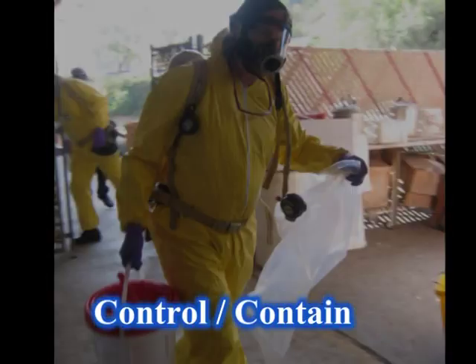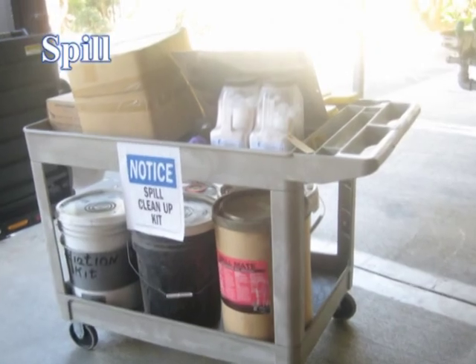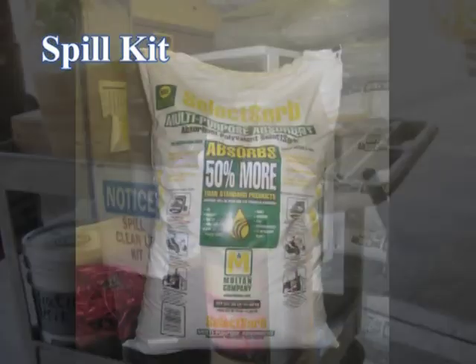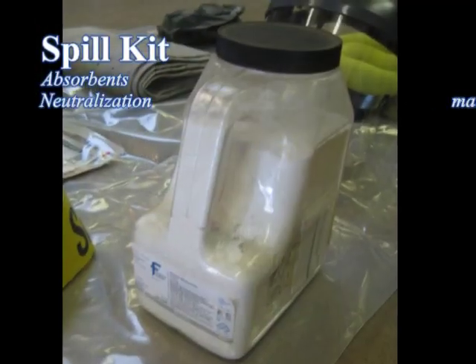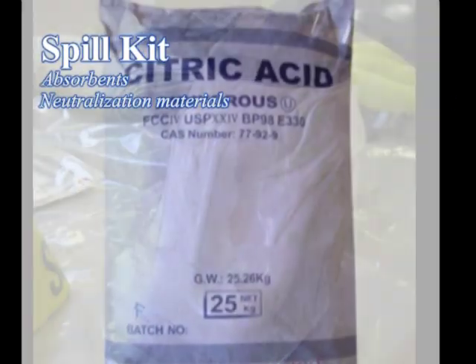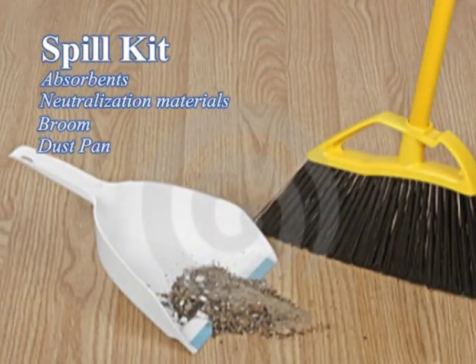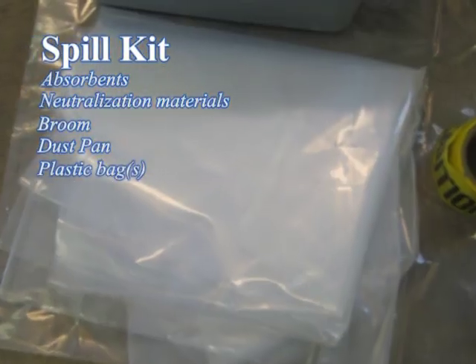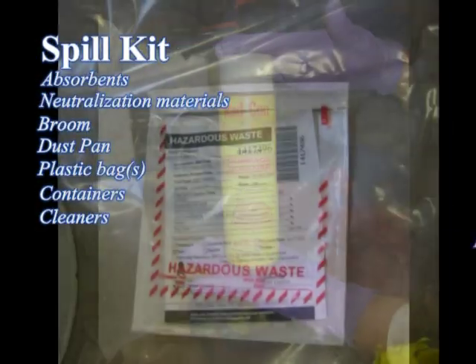After selecting the right PPE for the job, you can proceed to control and/or contain the spill. Start with obtaining a chemical spill kit. Examples of things you will need include absorbent material, chemicals to neutralize corrosives such as sodium bicarbonate for acids or citric acid for bases, a broom and dustpan, plastic bags, a secondary container, and cleaning solution.